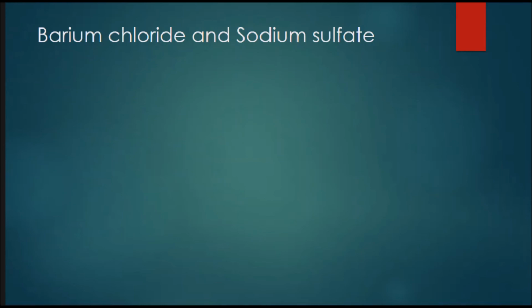So that is a barium sulfate solution. It's going to be a suspension because the barium sulfate is in crystal form, and barium sulfate cannot be dissolved, so it's not going to enter into your bloodstream, which is a good thing because barium could do some nasty damage to your body. It's going to stay in your gut. So as it goes through your gut, it's going to coat it, and at a particular time, they've got it timed perfectly. They'll take the CAT scan, they'll take the series of x-rays.